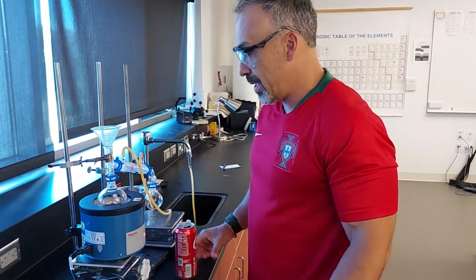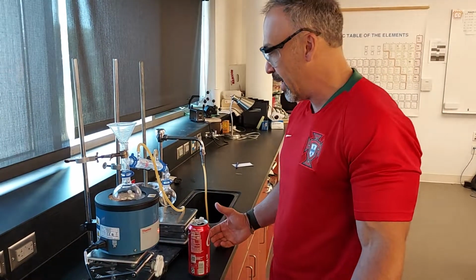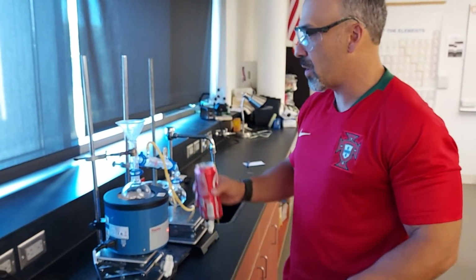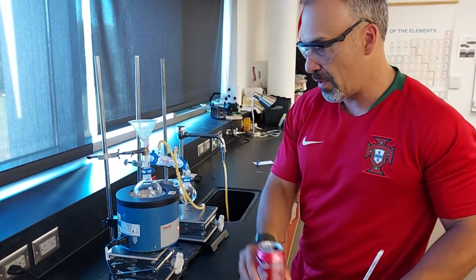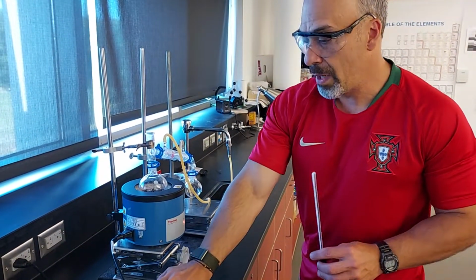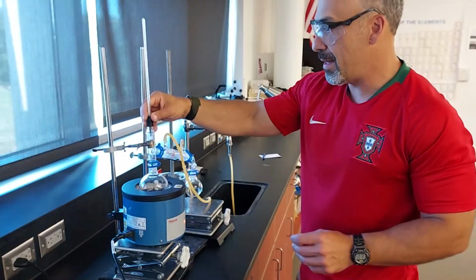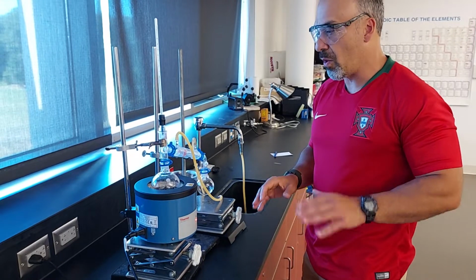All right, so since I can't have the Coca-Cola, Mr. Fall suggested we distill it. So what we're going to do is add the Coca-Cola to this funnel, which is going to put it in this round bottom flask. And then we're just going to heat it up, and we're going to capitalize on the idea that this mixture has a bunch of different things in it with all different boiling points.